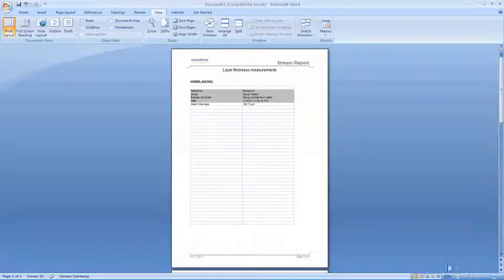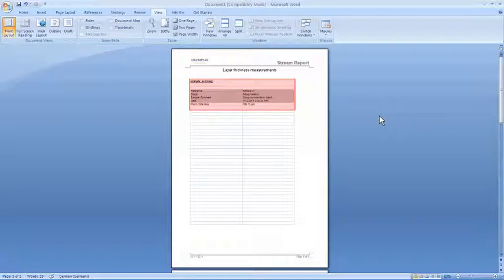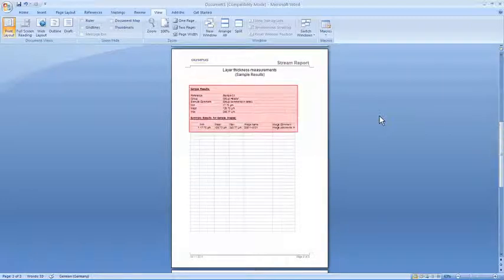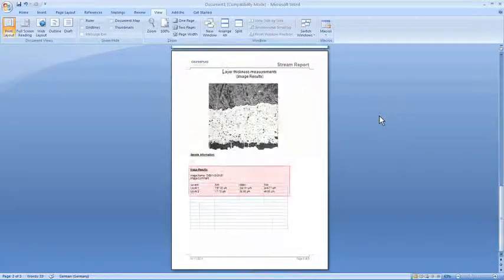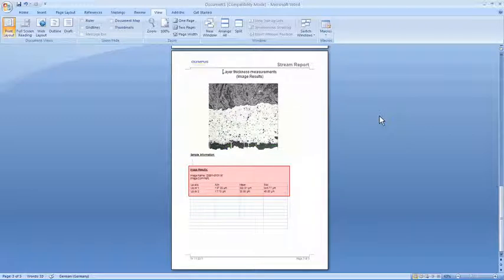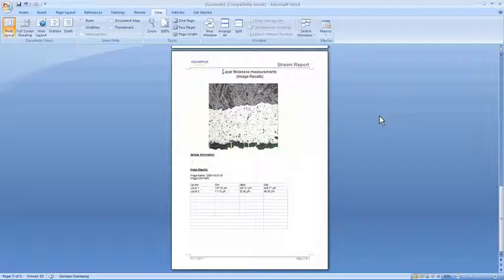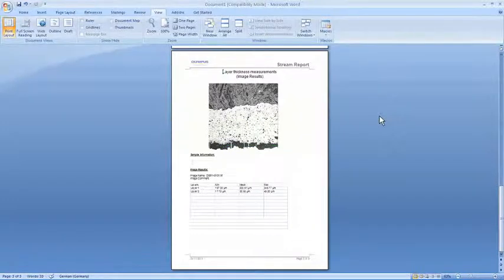Once the report generates, it will open within Microsoft Word. The first page shows the analysis summary. The second page shows the sample results. The third page will display the image and the individual layer measurements. The report can now be saved as a Word document locally or into the optional database.